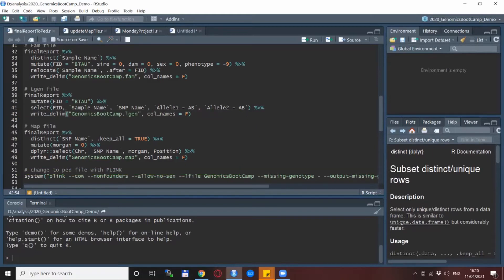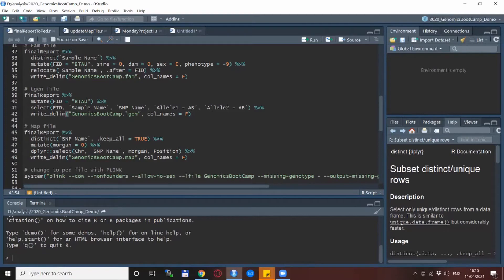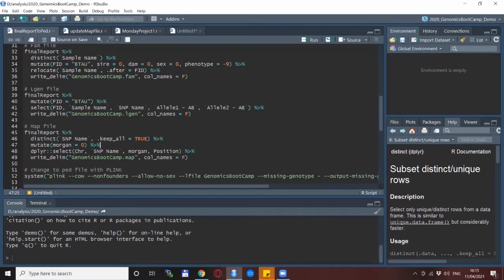And the last thing is the MAP file and in this file we have one line for each SNP. So we start again with the final report, keep one line per SNP, add the column for Morgan positions. In this case we put them all to zero and then we select the columns that we need and write them out in the genomics bootcamp.map file.